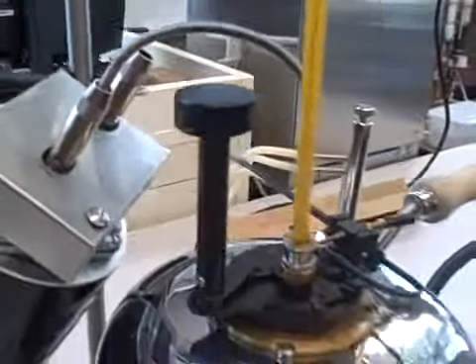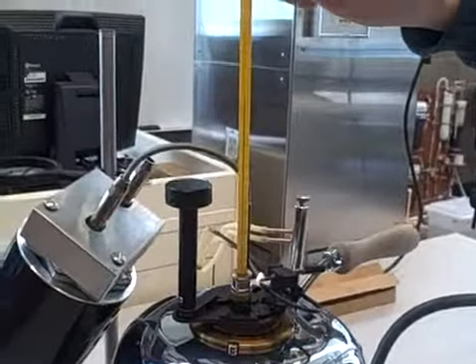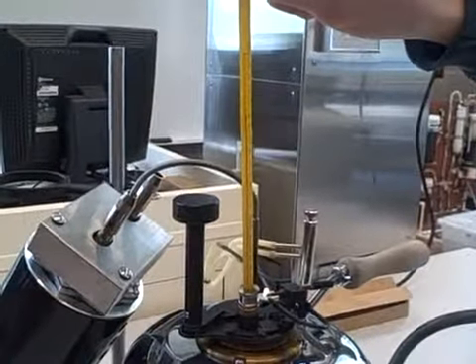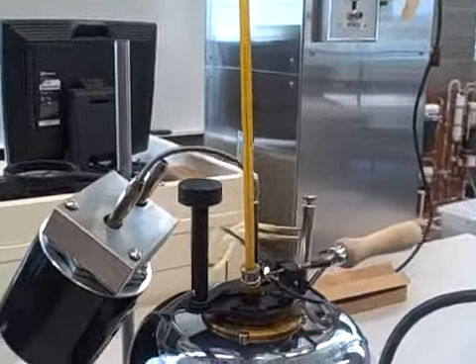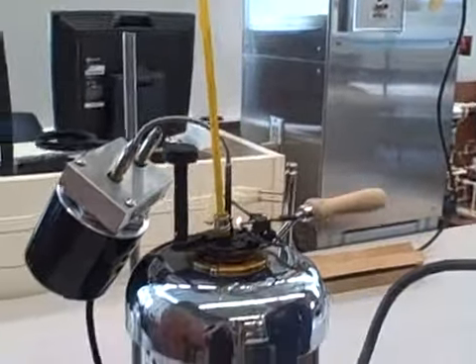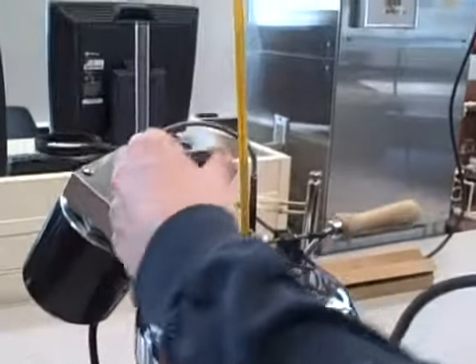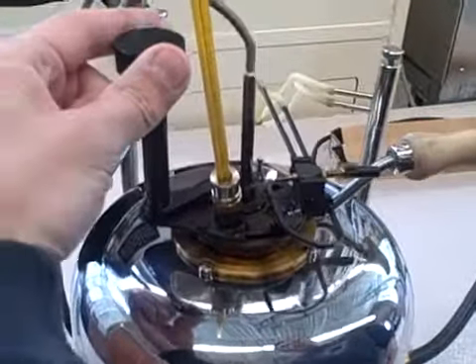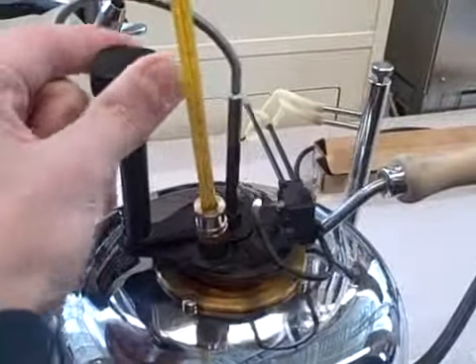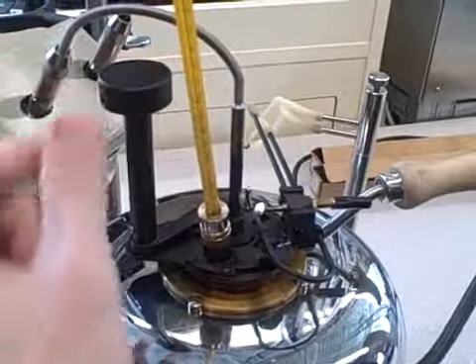Then you just want to keep watching the thermometer. Right now it's already been preheated — it's about 182 degrees. When you go to test the flame, turn the stirrer off, and you turn the knob which lowers the test flame into the cup, just a quick turn like that. And we did not have a flashpoint yet.